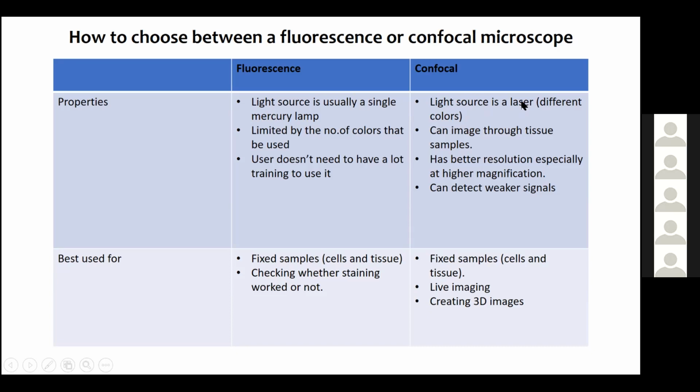So it gives you a lot more clear images, resolution, and a bigger spectra to image your samples, because now if you have 5 or more colors, you're going to get more sensitivity to those wavelengths.